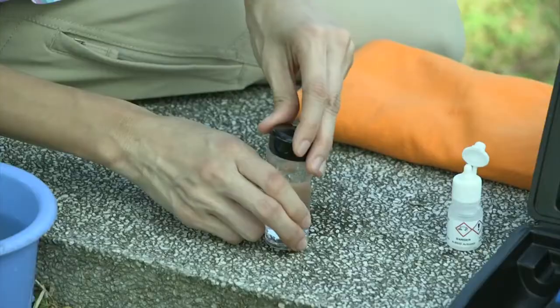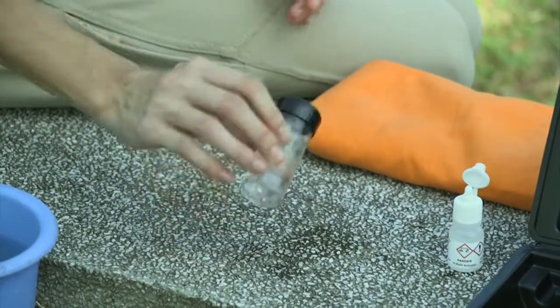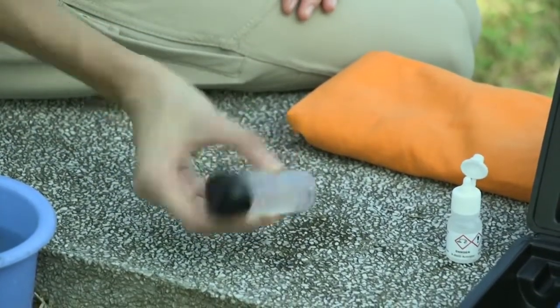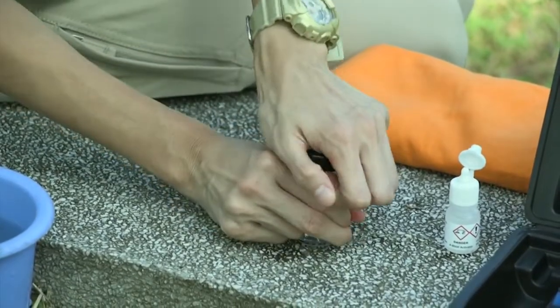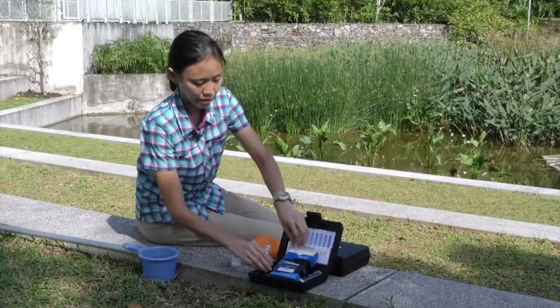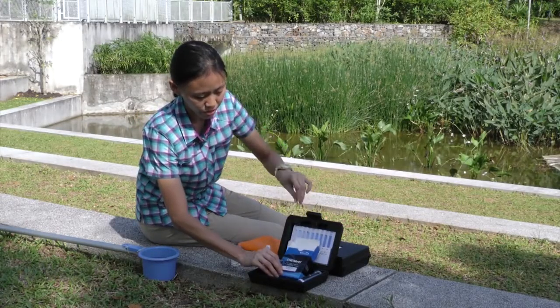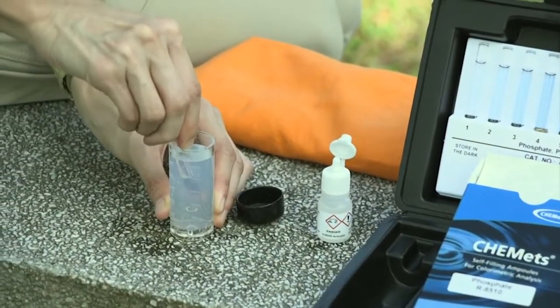Cap your sample cup and shake it to mix the contents well. Place the phosphate ampule tip first into the sample cup and snap the tip.